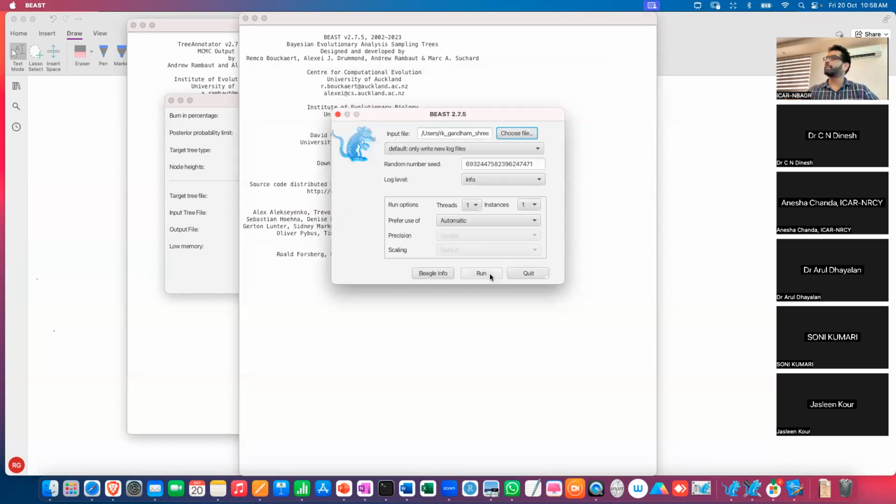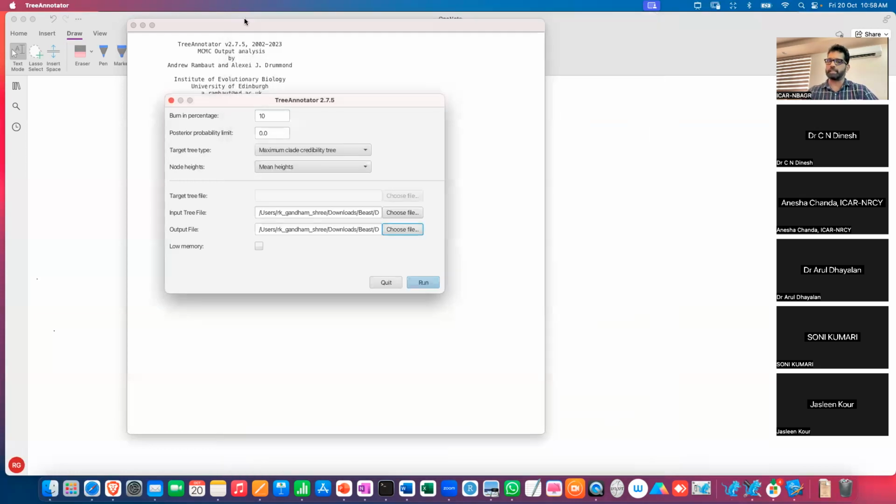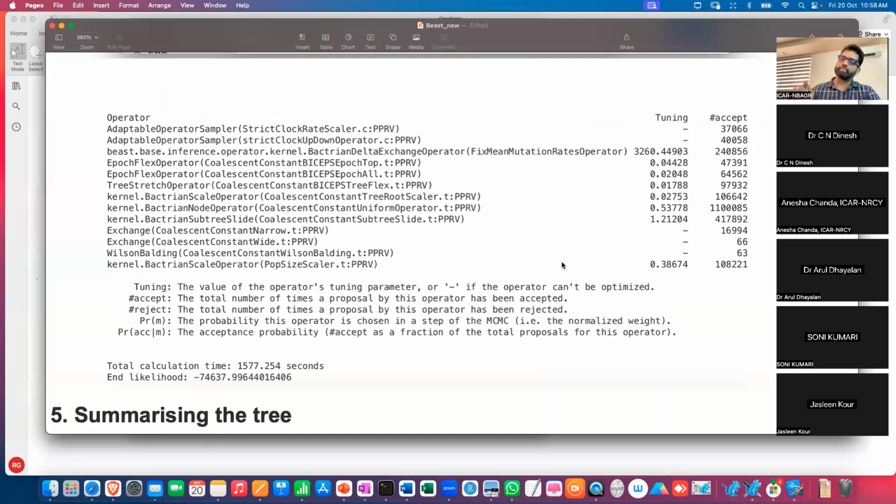Open it and then run it. Is that okay? The moment it starts running, it will not run because there are certain overlapping files over there. We have already run that, the same name, and sometimes it creates a problem. We're done. Okay? Now, guys, what did I tell you? After running BEAST, I also explained that the output of BEAST that you have run with the NS file and the output of BEAST that you have run with the normal MCMC file are two different outputs.